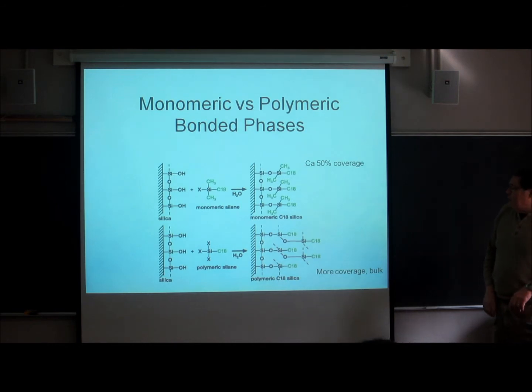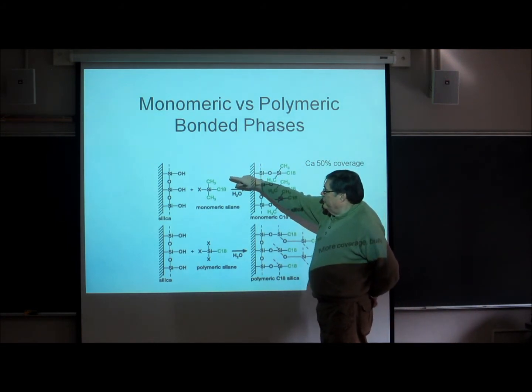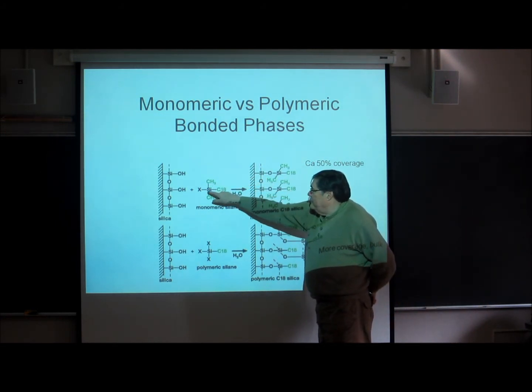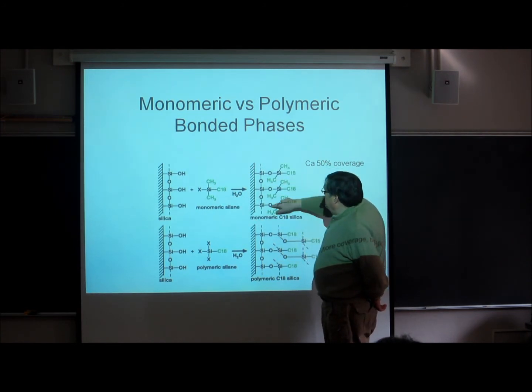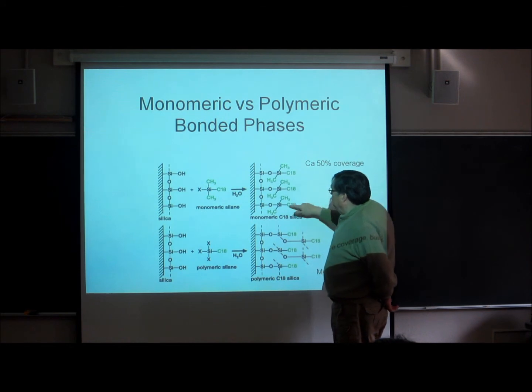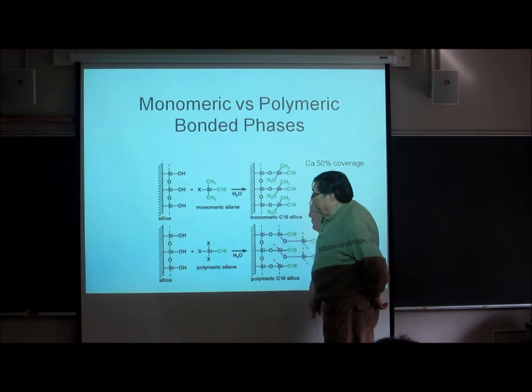So this also shows you something about polymeric bonding. Here we have the most popular species, the dimethyl C18 with chlorine. And then that bonds and leaves us with these long chains. And this is the idealized view. It doesn't show any remaining SiOHs.